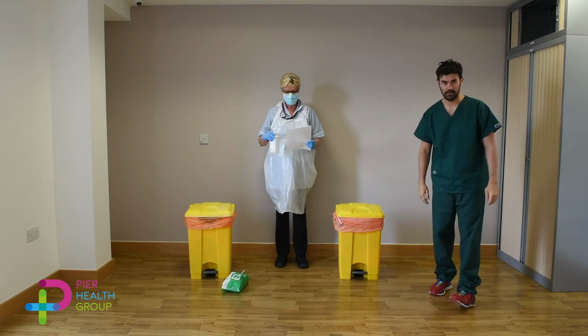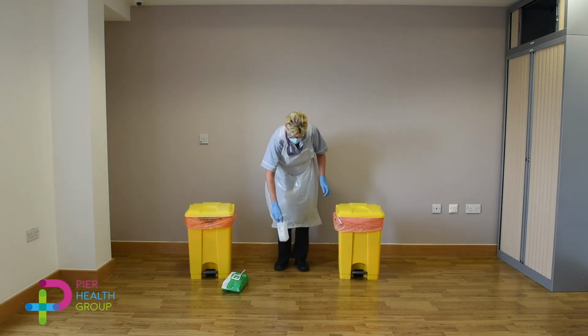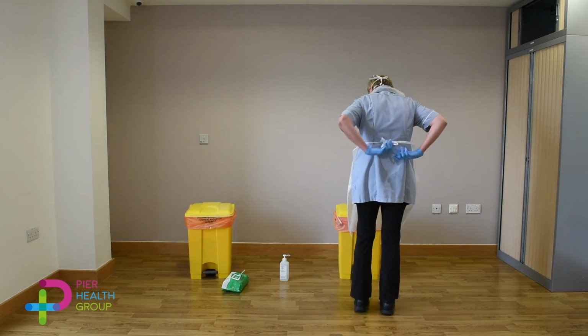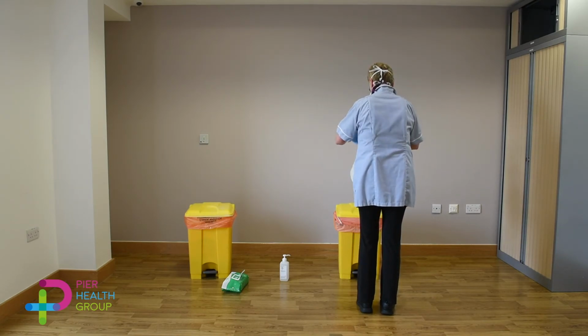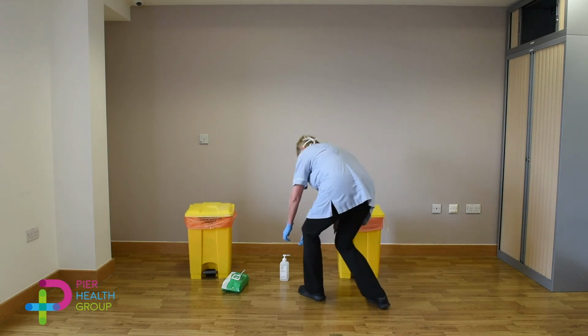Step 15. You are now clear to leave the safe undressing lane. Step 16. Safe undressing officer. Carefully remove apron as shown in video and place in the clinical waste bin. Sanitize gloves.